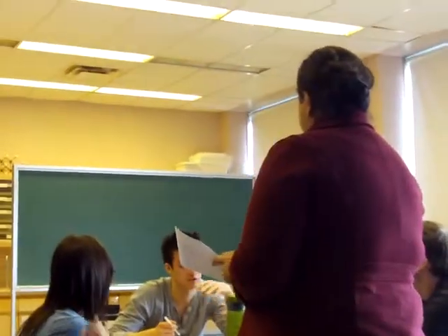I want you to formulate, talk among yourselves, why do you think you can cut through these metals? What makes them unique? And why are they different than other metals? And also maybe talk about why did it corrode so fast as well. So kind of speculate what an alkali metal is. So talk among yourselves. Because what it is, they carry one extra valence electron on the outer shell, so it's very readily donating that electron.